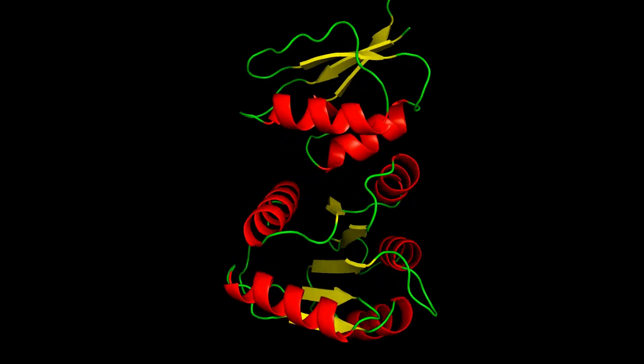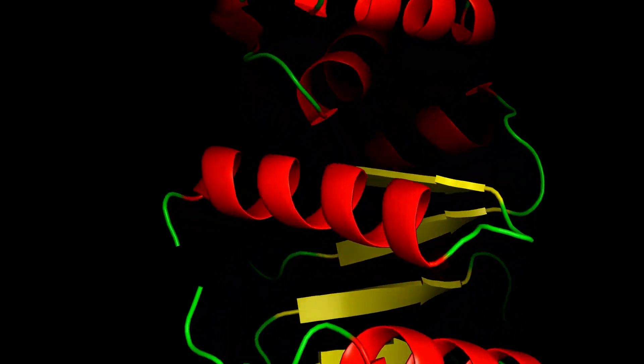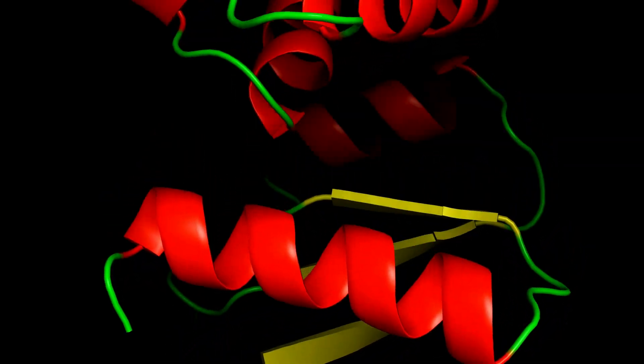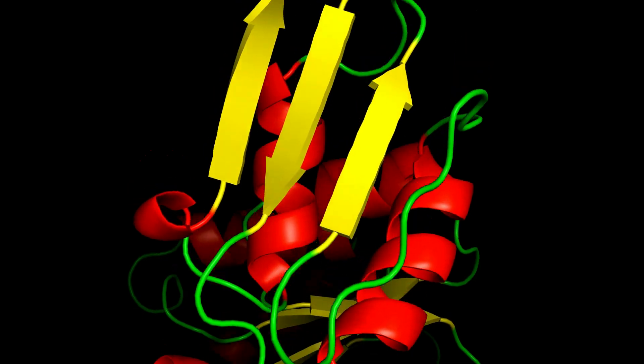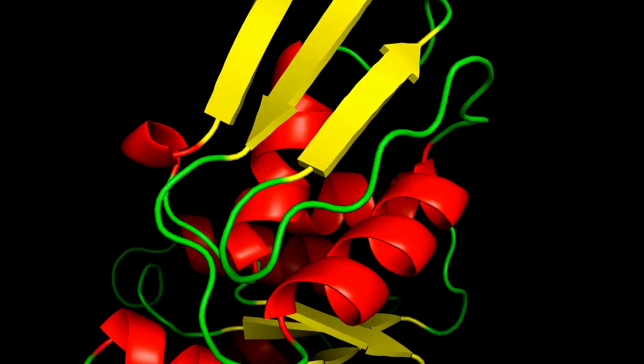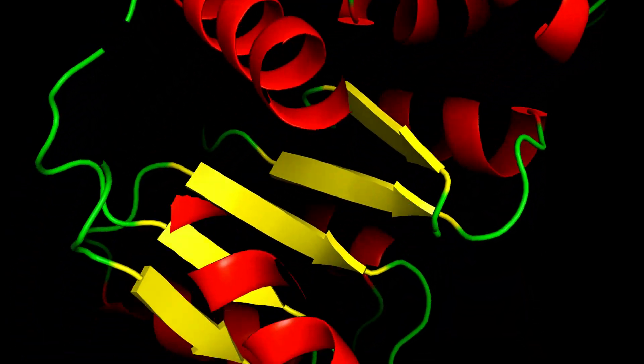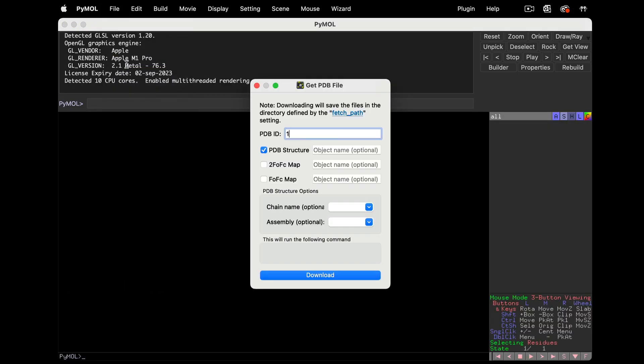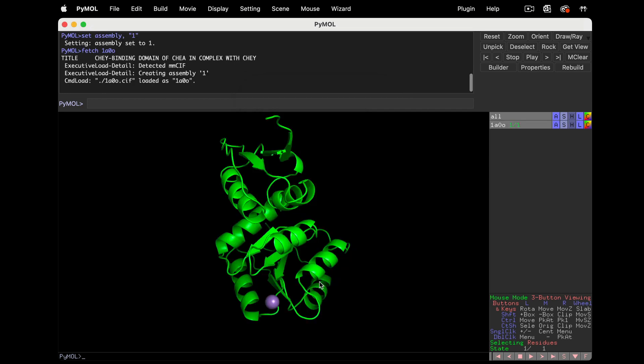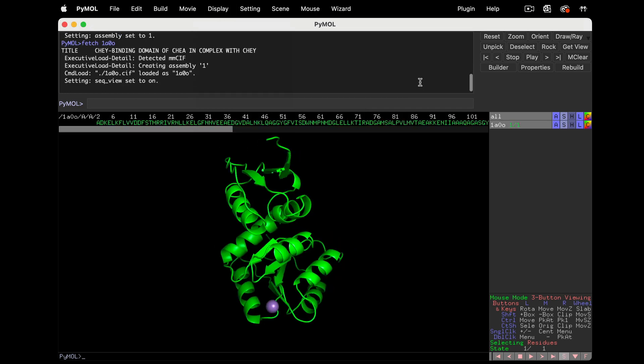And as an added bonus, they contain all the basic secondary structure elements I want to teach you about. Load the structure as usual, 1A0O, and display the sequence.